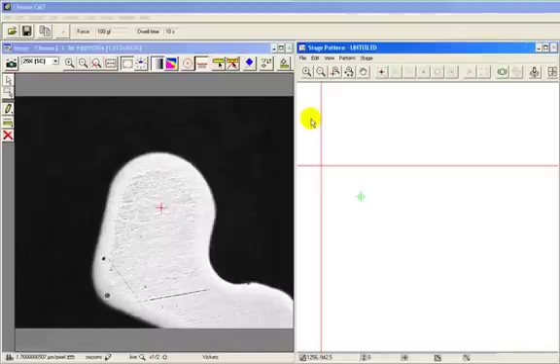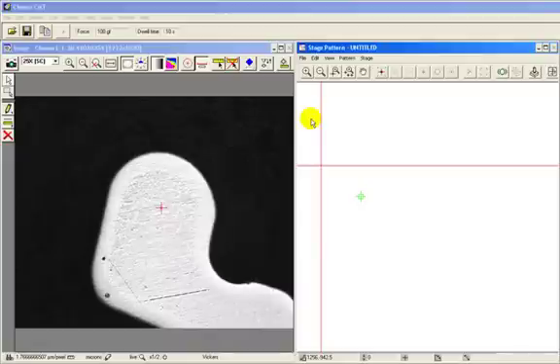In this example, the traverse must start on the flat edge of the arm and extend perpendicular to the side of the surface, passing through the center of curvature of the tip. The position of the start point cannot be seen directly and must therefore be calculated.